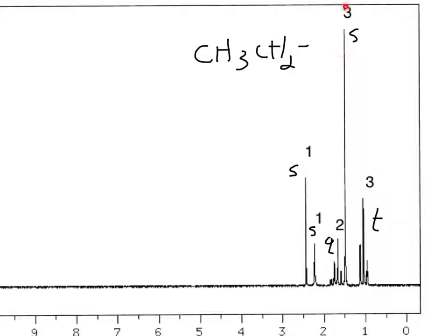We've also got a singlet that integrates for 3. There's a good chance that that's a methyl group. We don't know what that methyl group is attached to, but whatever this question mark is, doesn't have a hydrogen on it, or this would not be a singlet.